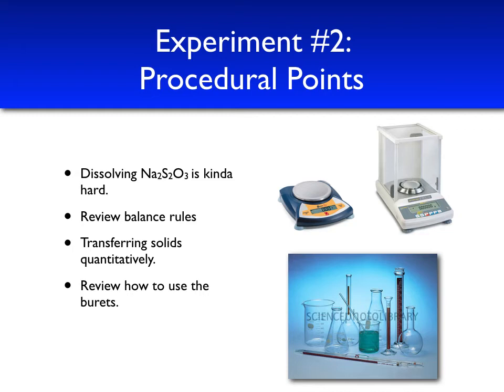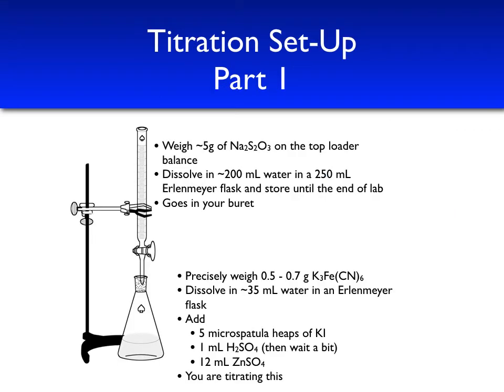We'll review here how we use our burette by noting that we must take our volumes out to the hundredth place. So even when subtracting your final and initial burette readings, you do want to make sure that you include that hundredth place, even if it's a 0.